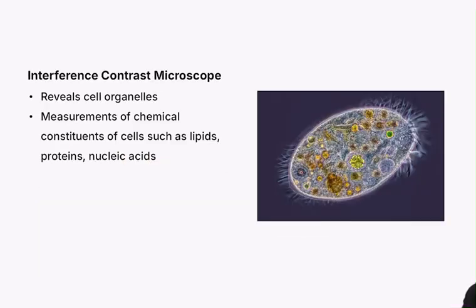But if you don't see any fluorescence, this means your NADPH and G6PD are not working fine and you have G6PD deficiency anemia. So, done with the fluorescent microscope, we move on to the next one, a rather rarely asked one called the interference contrast microscope. Again, you're trying to create a contrast, and that will only be when you want to peep inside the cell. You want to see the organelles inside the cell, because everything will have a different phase, everything will have a different contrast.